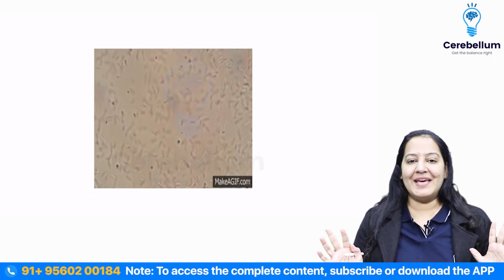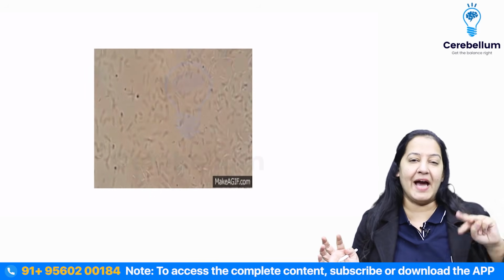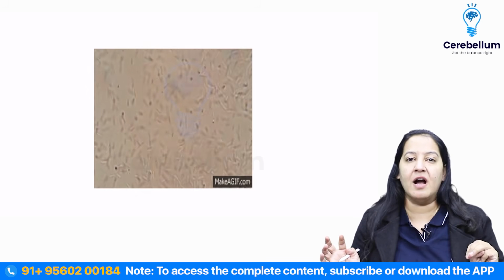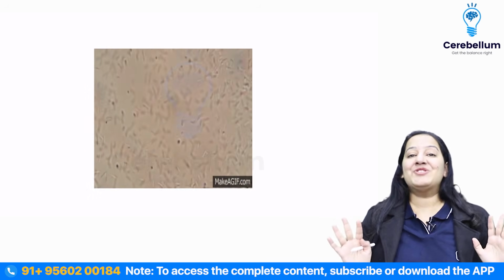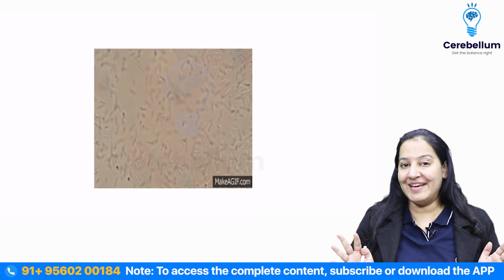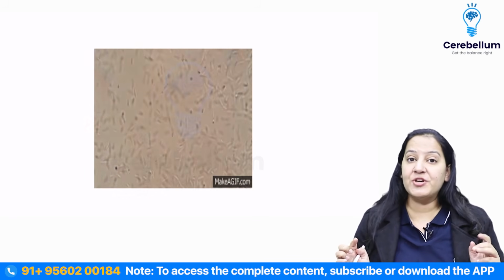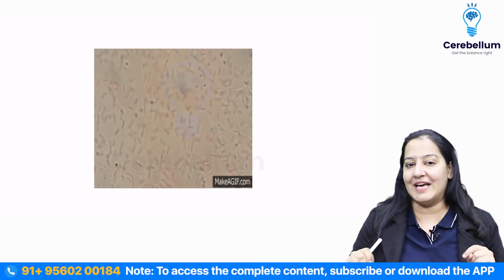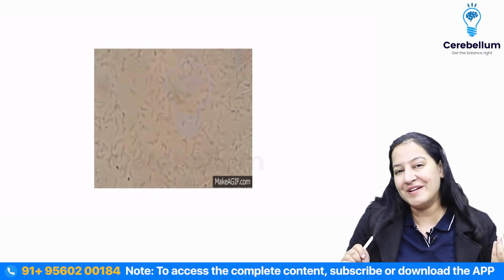So this is the thing. Can you see here? Can you appreciate the motility? Now, if I ask you what is the shape of the bacteria, what is the size of the bacteria, what is the structure of the bacteria, can you answer? You can't. So you cannot comment on the morphology of the bacteria on an unstained preparation. But yes, on unstained preparation, you can comment on the motility. I can see something is moving, but exactly what is moving, I cannot comment on that.